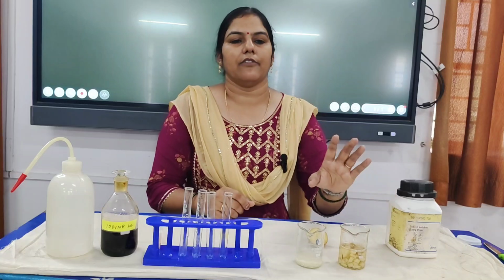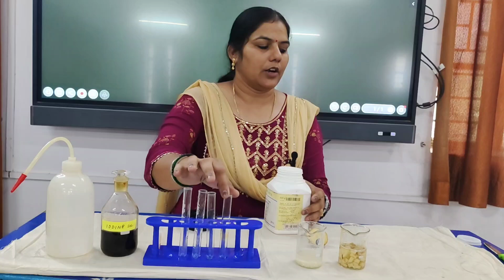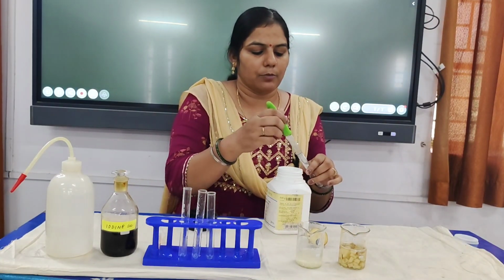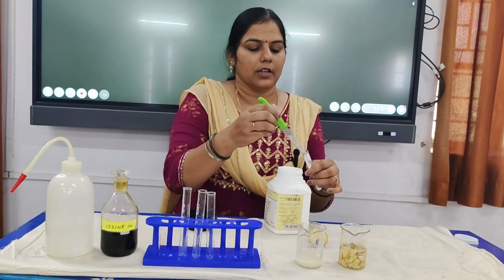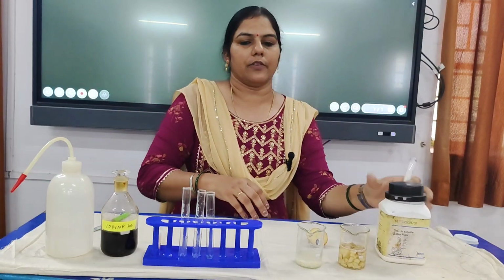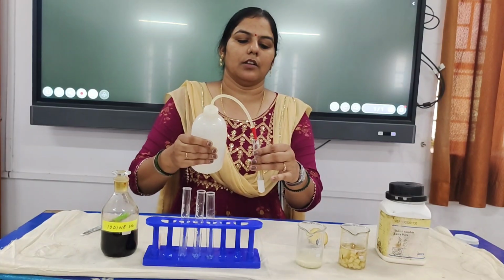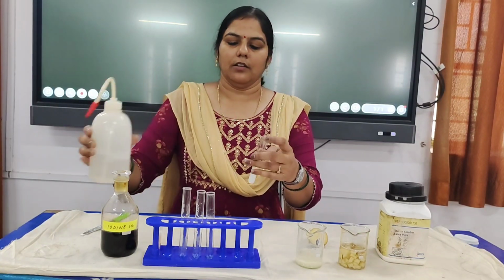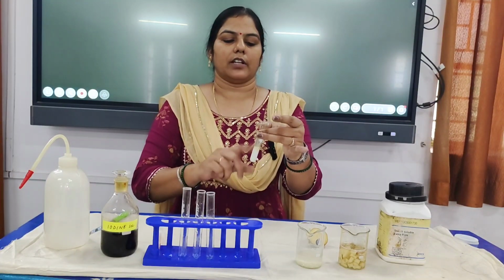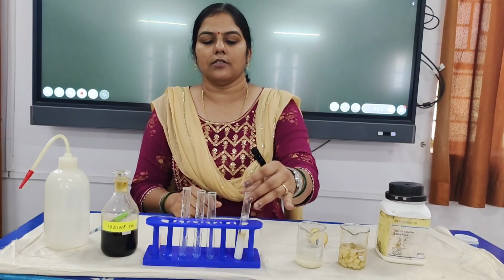First of all, I will make a starch solution so that I may have a positive control. For our positive control experiment, I will dissolve a small amount of starch in water in this test tube. This is starch powder and this will serve as the control experiment. Here I am dissolving the starch powder in water so that our experiment may have a positive control. So this is the starch solution.